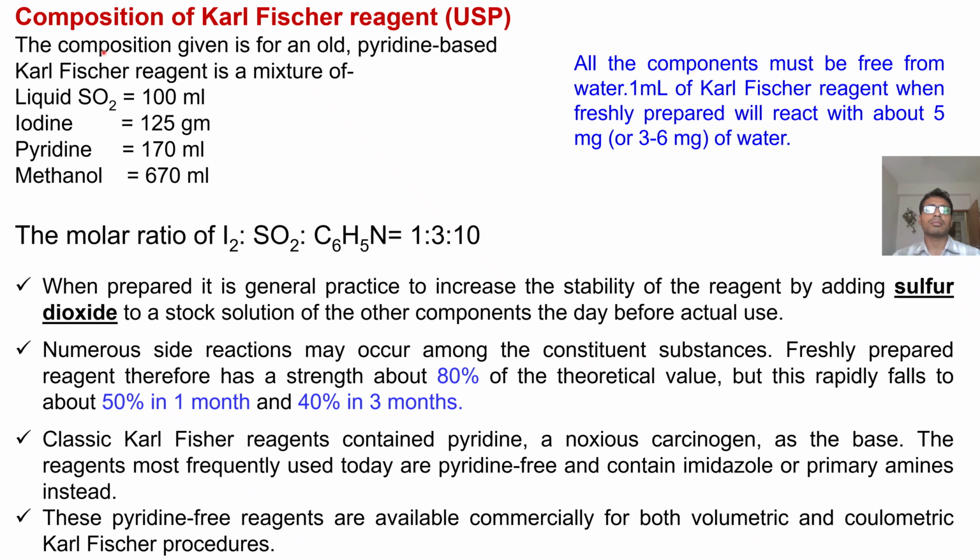So a question may arise: what is the rationale of using sulfur dioxide, iodine, pyridine, methanol, imidazole? What should be the constituents or the amounts? It shows the overall volume of your reagents. All the components must be free from water. 1 ml of Karl Fischer reagent, when freshly prepared, will react with about 5 milligrams of water. So the molar ratio is 1:3:10.